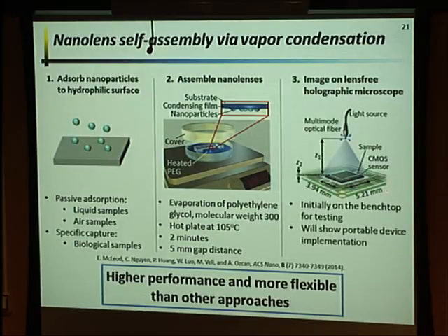And then what we do is we take our sample and we're going to put it on our lens-free holographic imager. Initially we're going to do this on the benchtop, but then in maybe about 10 or 15 minutes I'll also show you a portable device where we kind of combine these two steps together.